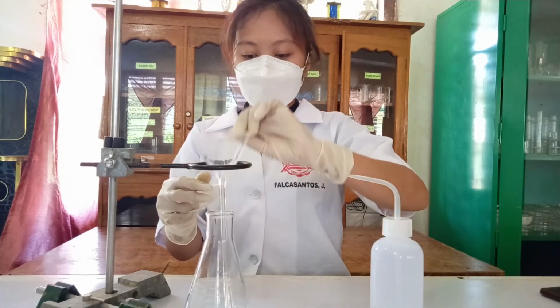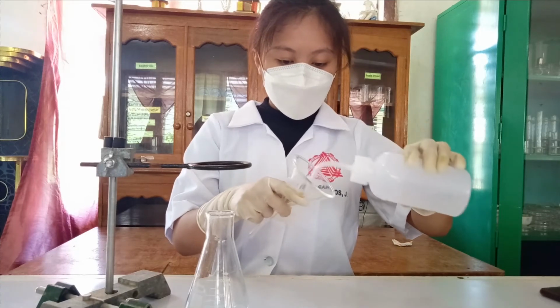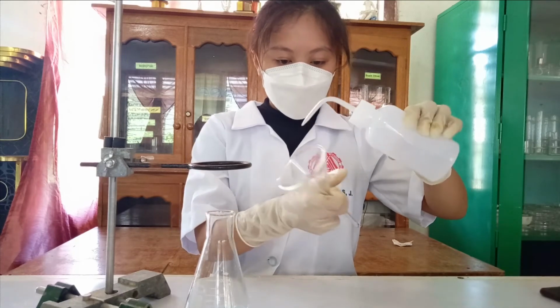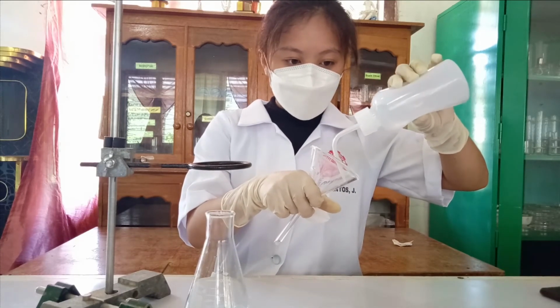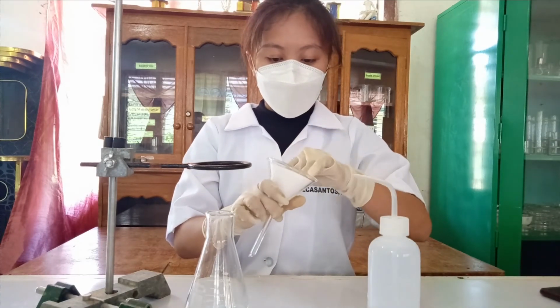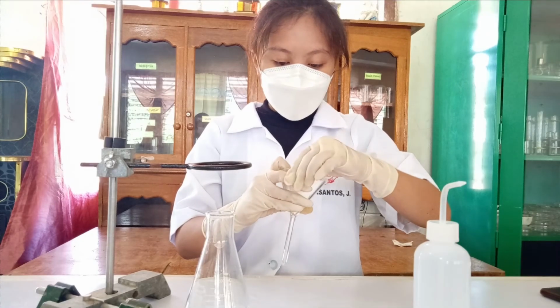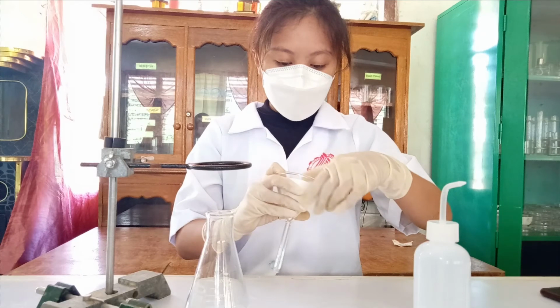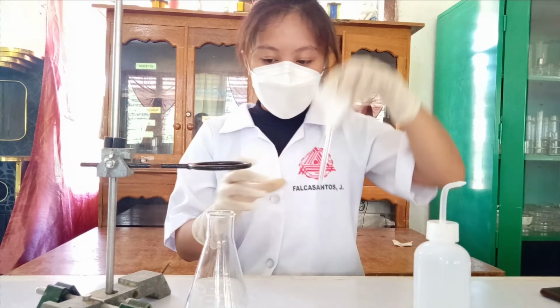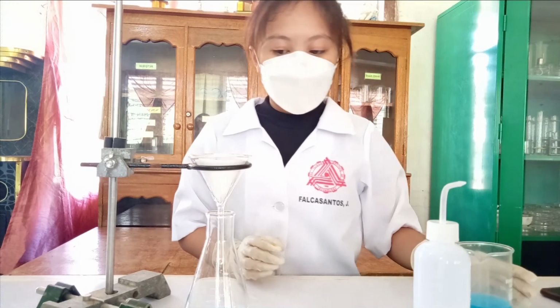Pour some water into the mouth of the funnel to wet the filter paper. It is necessary to wet or moisten the filter paper to secure it to the bottom of the filter funnel. Do this using the solvent to be used in the filtration and press the top of the paper against the funnel all around its circumference to seal the space between the funnel wall and the paper. Without this step, the filter paper may float when the solid solvent mixture is poured. Consequently, solid product is lost as it passes around the filter paper, ending up in the filter flask below.